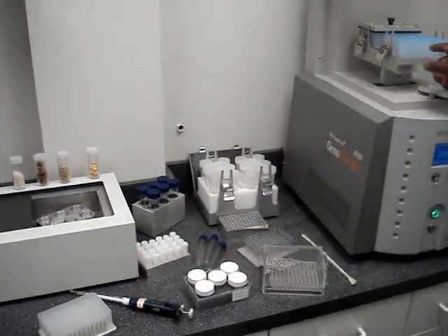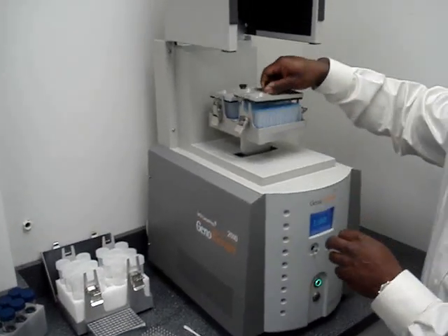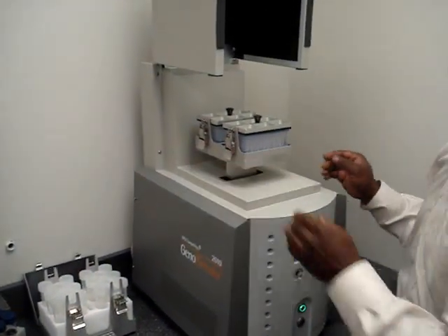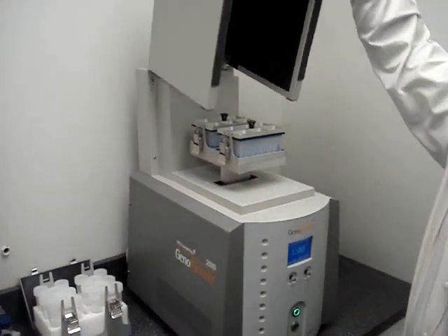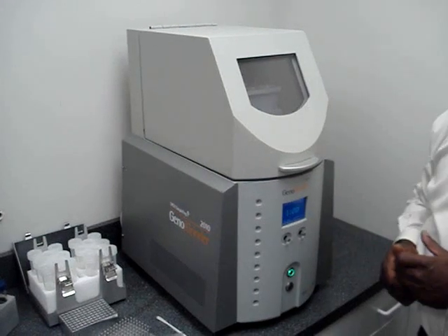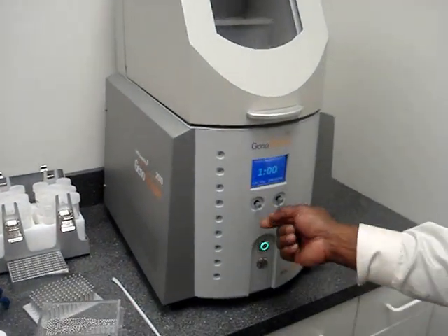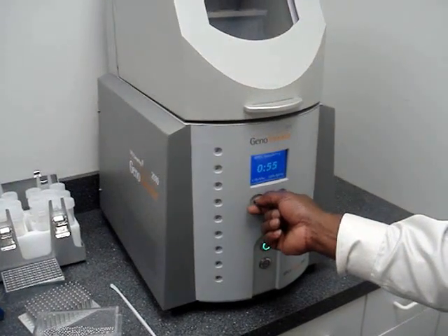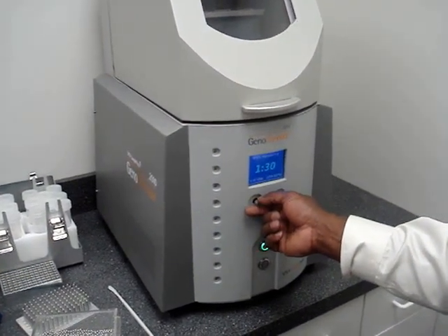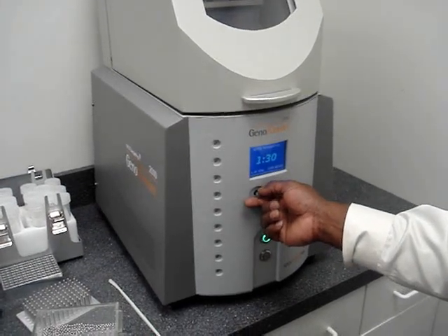Then the titer plate is set into the system with the cap mat. Clamp down with a nice tight snug. Close the lid and then program your run times into the system. This is easily done by adjusting this knob to the left, which will adjust all the way up to 20 minutes, though that is not necessary. Typical run times are 1 to 2 minutes.